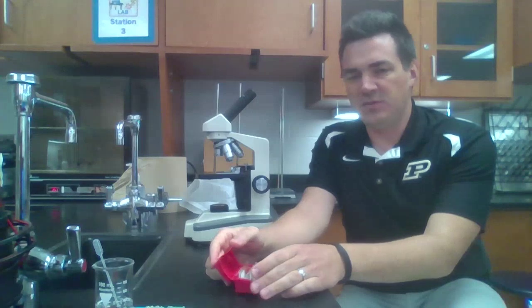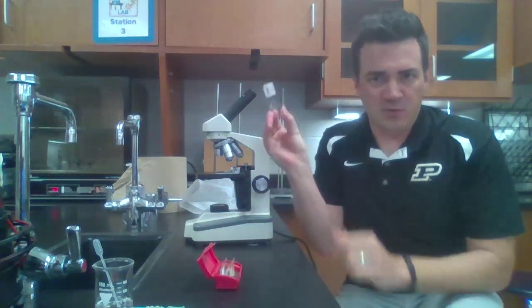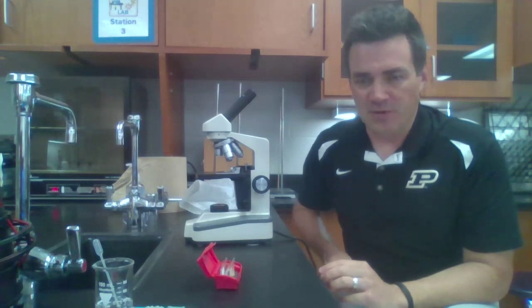Now, you're going to be looking at both your own hair as well as the hair samples from your suspects or your persons of interest today. Your persons of interest ones are going to be found in one of these little red boxes. These red boxes have the microscope slides there. And so I'm going to use one of those to illustrate how to use the microscope properly.